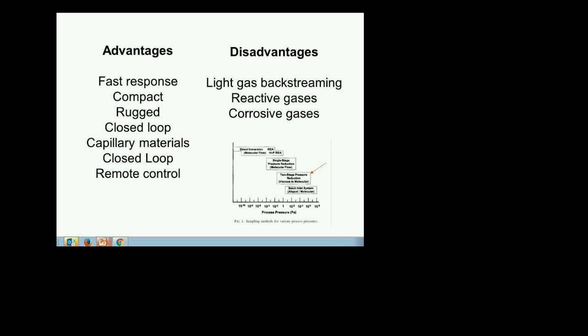So here's how I do it. The magnet only affects the electrons in the RGA, and this is why knowing how the RGA works is important. There are electrons only in two places in the RGA, in the ionizer region and in the detector region. This is as simple as this.